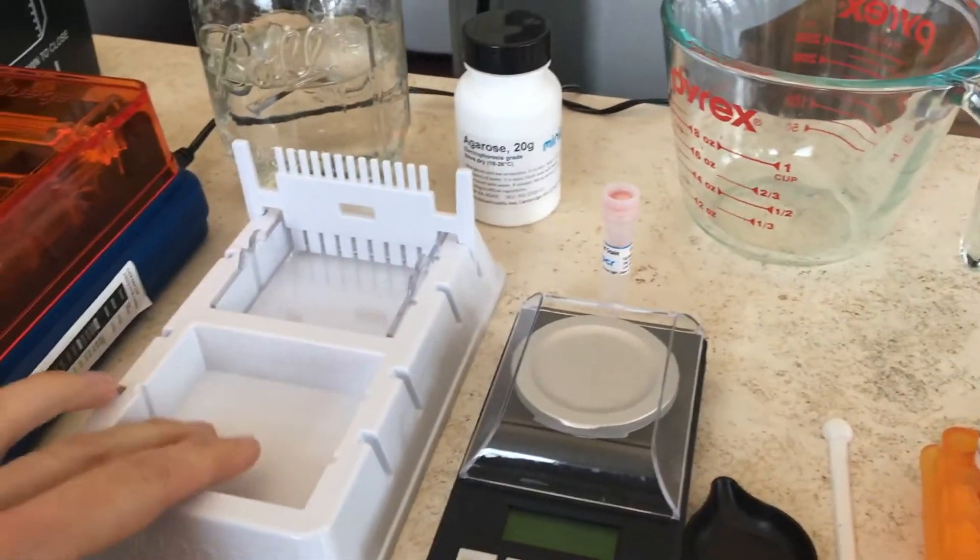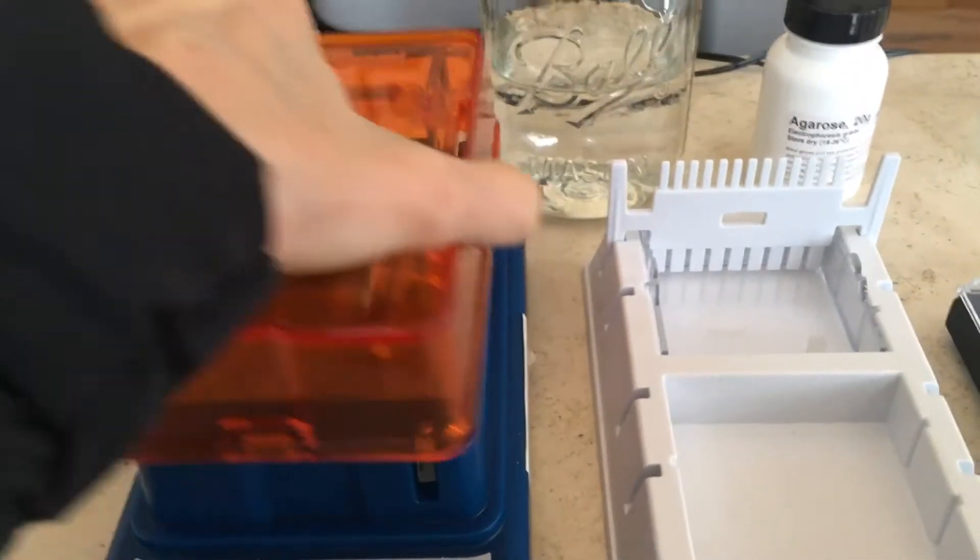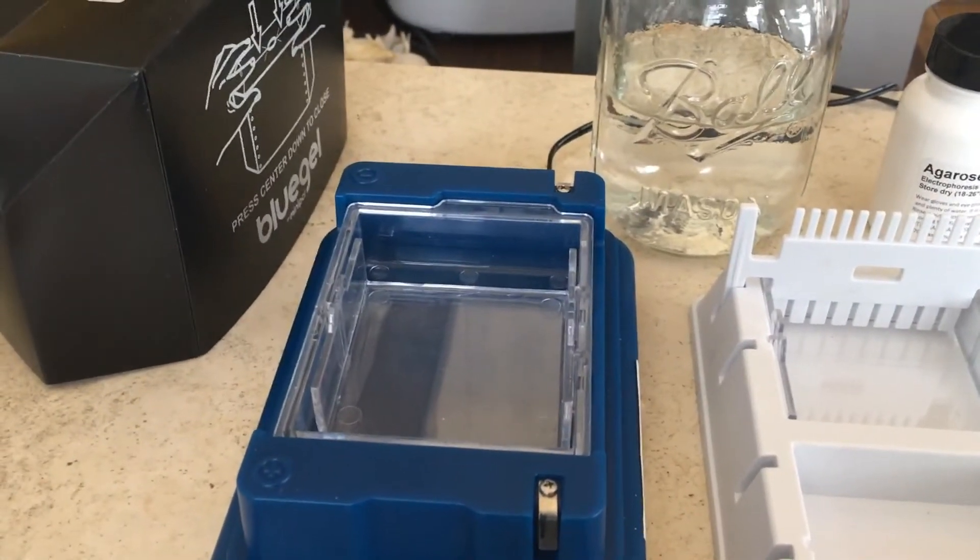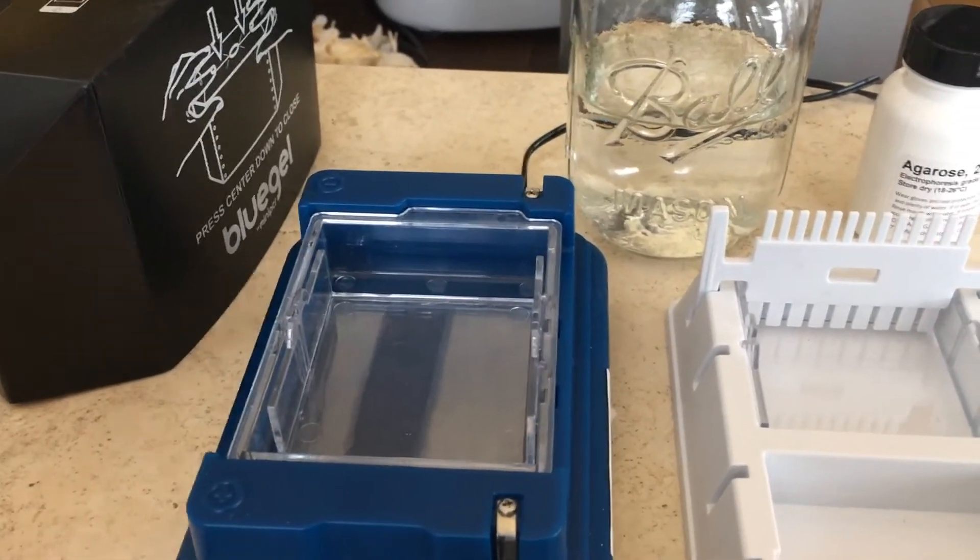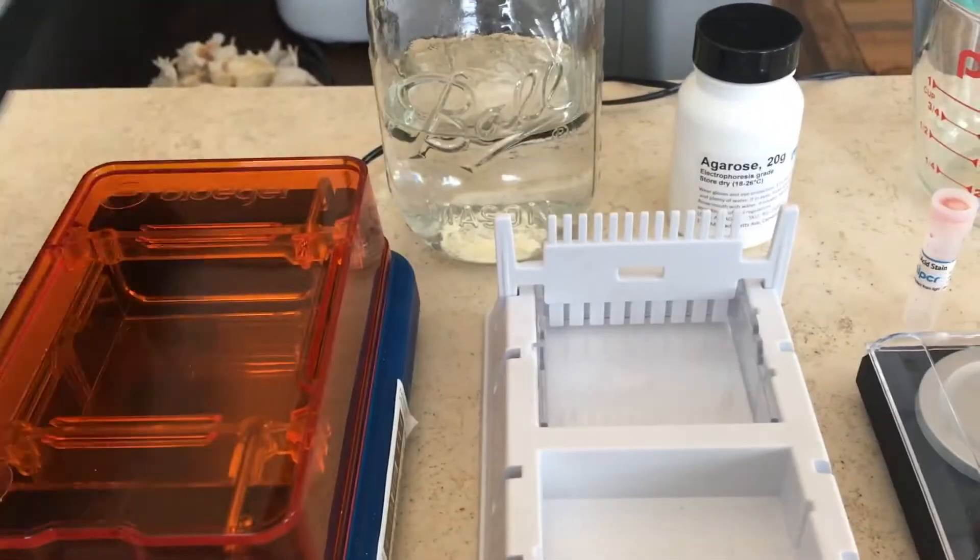We're going to pour a gel in here. There's a comb. This is our actual gel electrophoresis setup. We're going to put the gel in here and we're going to put some buffer on it and then we're going to force the DNA through it. This once again allows us to see it because you get better contrast looking through here.